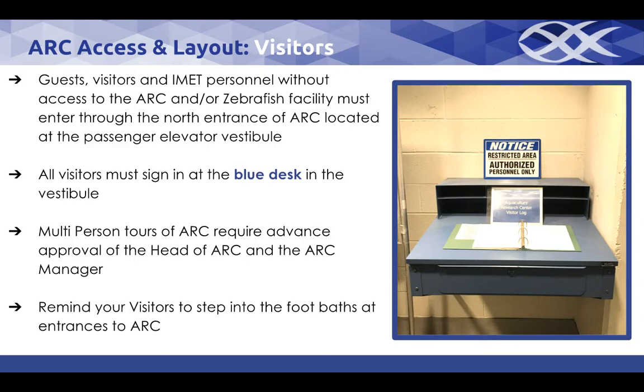If you plan to have a multi-person tour of ARC, you must notify the head of ARC and the ARC manager in advance of the tour so proper advance planning is conducted before the tour takes place. Please remind visitors to watch their step as they enter the facility since there are footbaths located at each entrance. Visitors should step into the footbath rather than step over it.